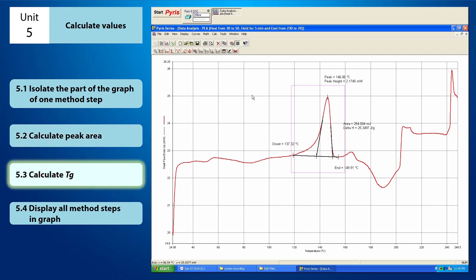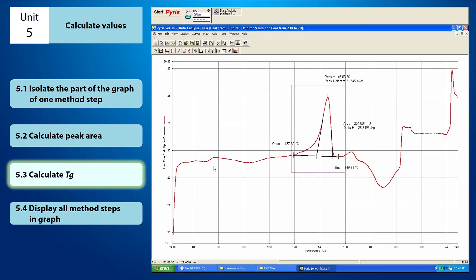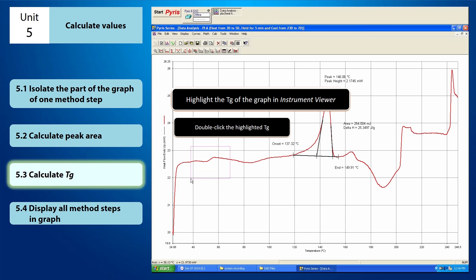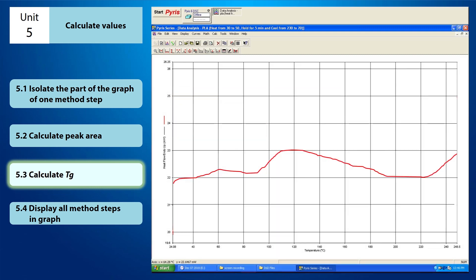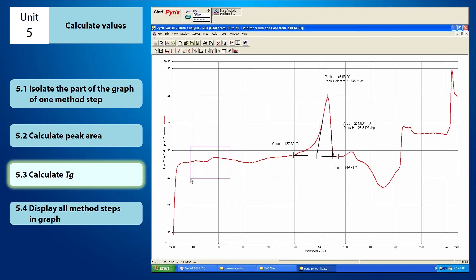Let's proceed to the TG calculation. This is how the TG looks like — it has a zigzag shape. If your TG appears small on the screen, you can enlarge it by highlighting the TG and double-clicking on it. If you want to see the full isolated part of the graph again, click Full Scale. You can enlarge the TG or peak curve whenever the curve is too small on the screen.